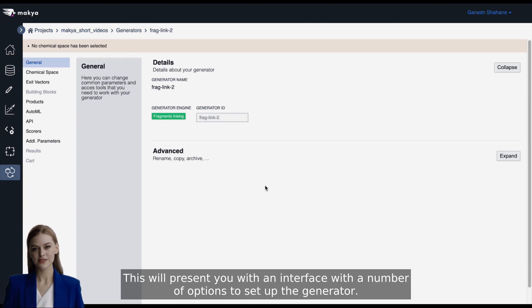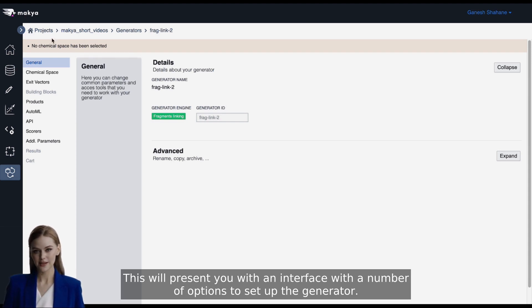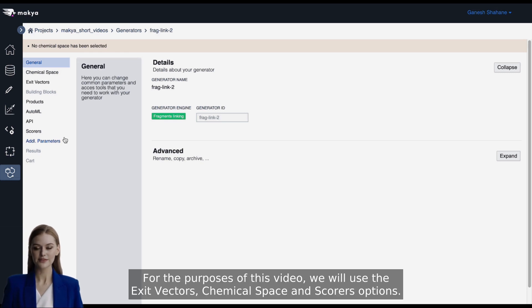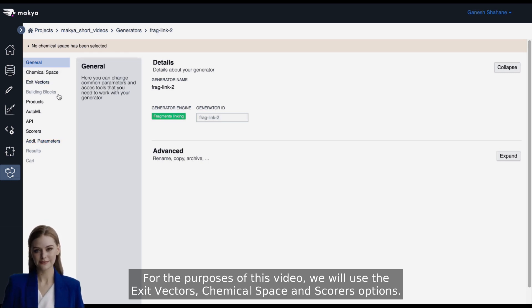This will present you with an interface with a number of options to set up the generator. For the purposes of this video, we will use the Exit Vectors, Chemical Space, and Scorers options.